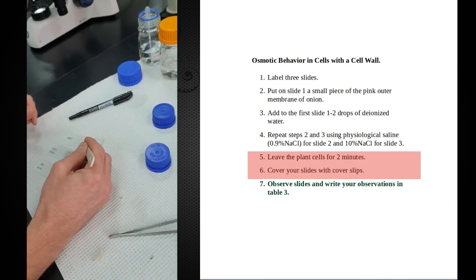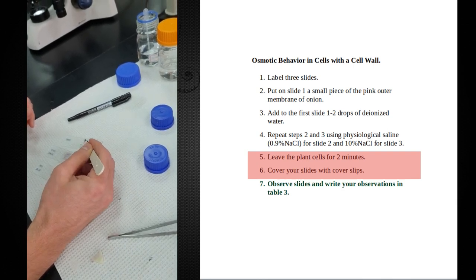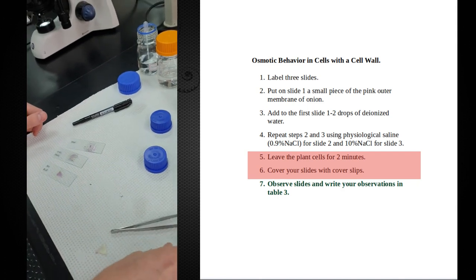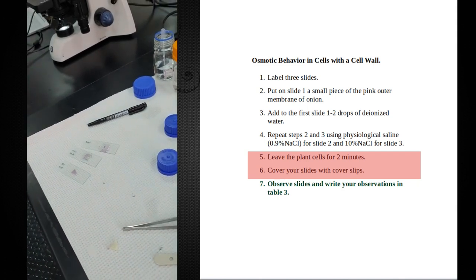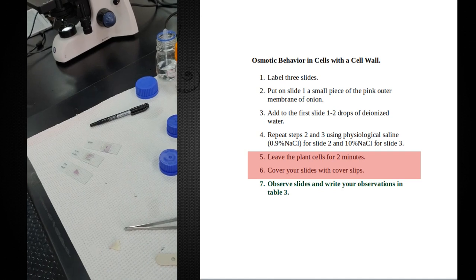And again, don't be afraid to press down gently to help flatten things out a little bit before you look at them. So we'll take a look at these under the microscope in a couple of minutes.